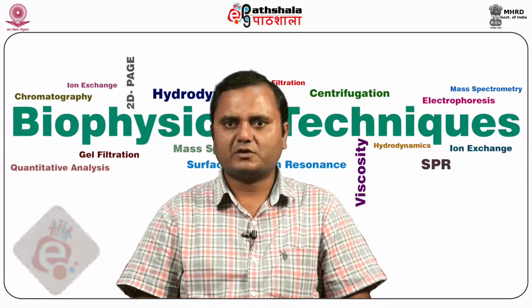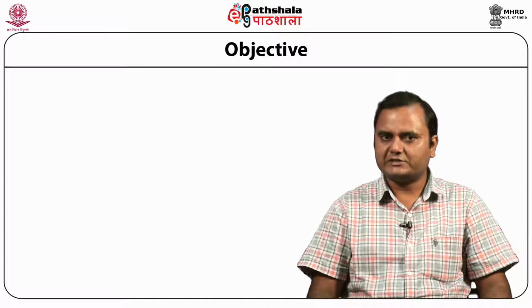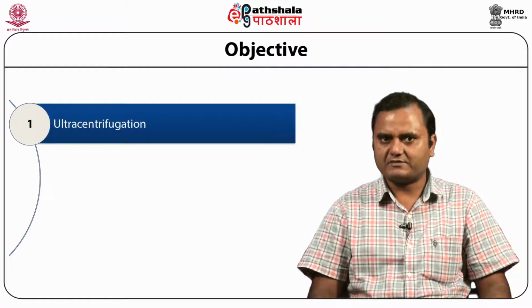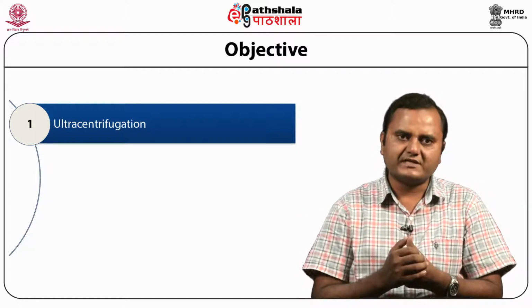Today I am going to talk about the module ultracentrifugation from the paper Centrifugation Technique. In this module we discuss the following things in detail. First, we discuss the basic concept of ultracentrifugation. What are the basic concepts of ultracentrifugation? How is this technique more advanced than the other forms of centrifugation?